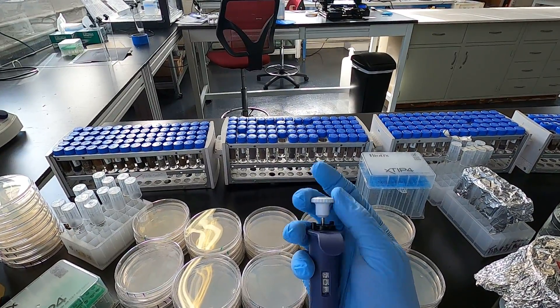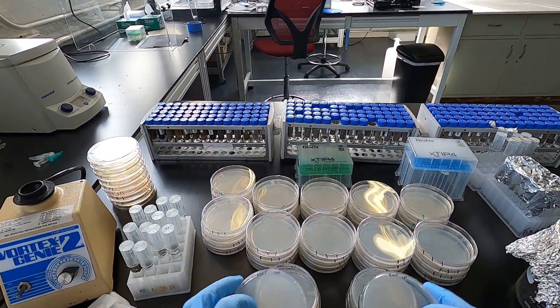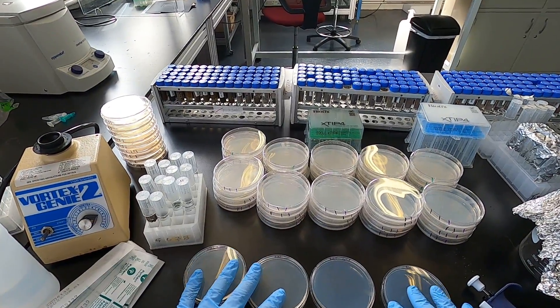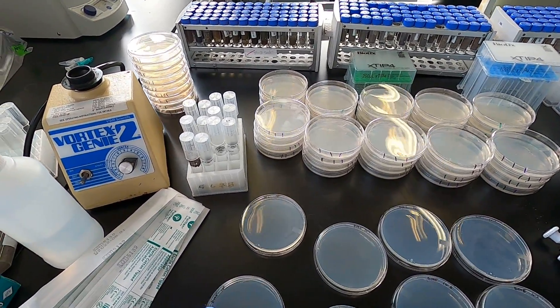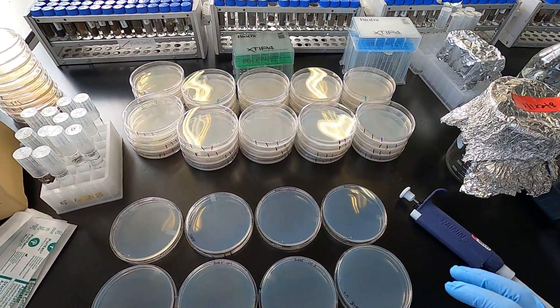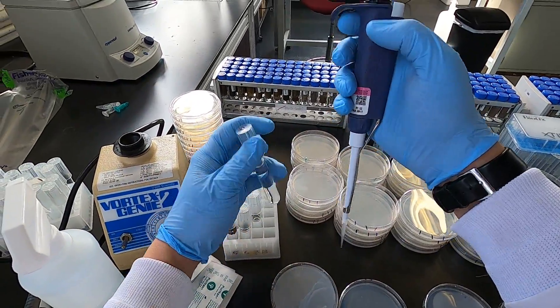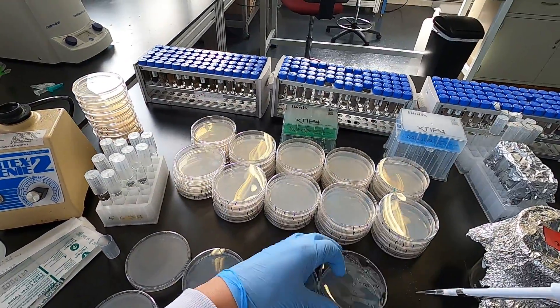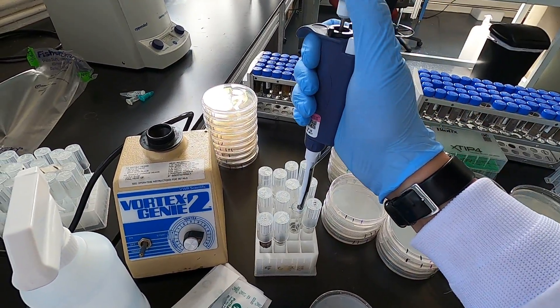Plating 100 microliters. Fill your plates out: 10 to the zero, 10 to the negative one, 10 to the negative two, 10 to the negative three. These are our dilution plates. These have different medias, so we're going to swap these. If you start at the lowest dilution, you don't have to change your tip. We'll get 100 microliters from the 10 to the negative three dilution and put it on the media, then go up to 10 to the negative two.